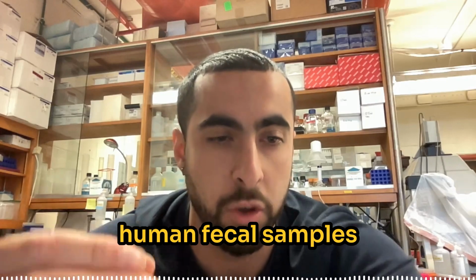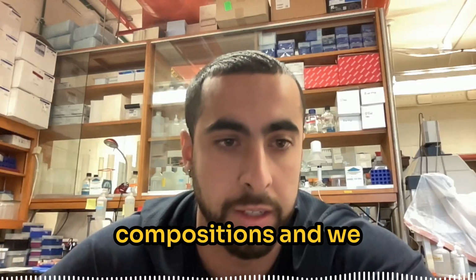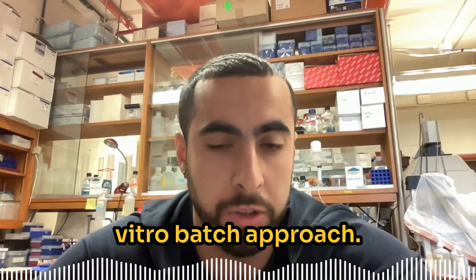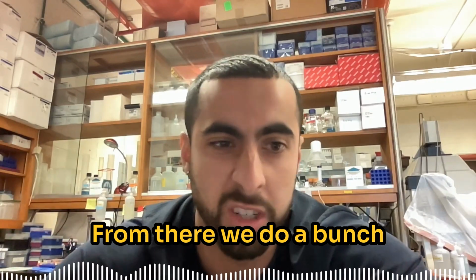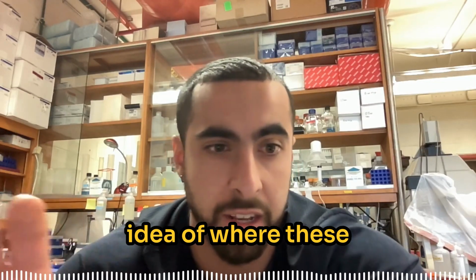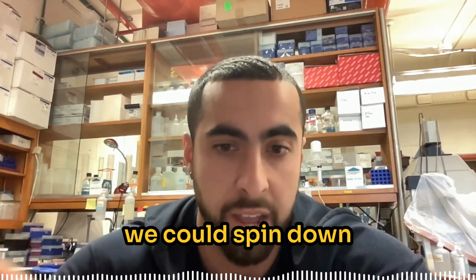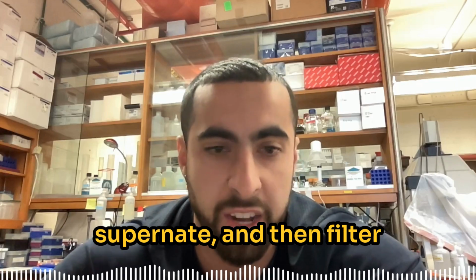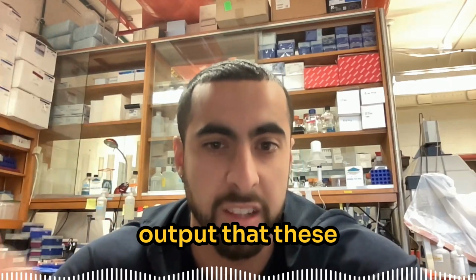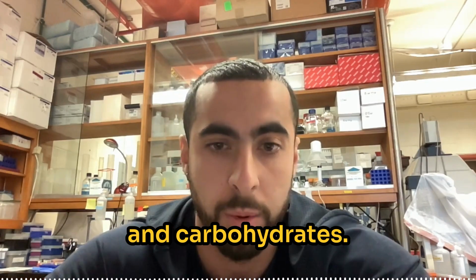approach where we could take human fecal samples derived from different compositions, and we could screen nutrients using this type of in vitro batch approach. From there, we do a bunch of different analyses, whether we sequence the DNA to get a good idea of where these compositions are shifting, but at the same time, you could spin down the plate, remove the supernatant and filter it, and then we could run it on a GC to get a good idea of the metabolic output that these communities put out in response to glycoproteins and carbohydrates.